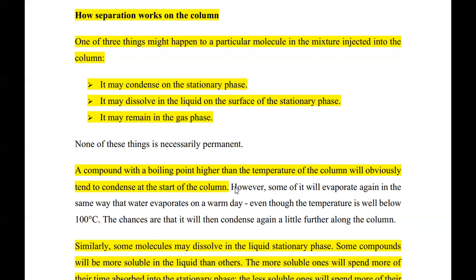Or in case there's a blockage on the column that leads to the detector. Of course, the gas that goes in there at low temperature, you find that it's able to condense. I'm saying that it may dissolve within the liquid. At some point, you may find that this sample dissolves within the liquid.